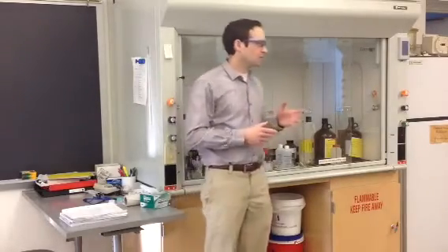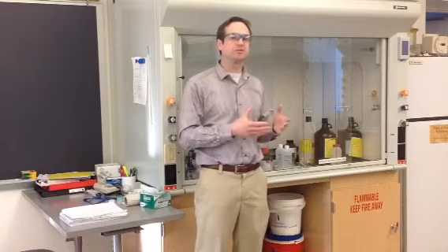So there's 3 things that you're going to have to add into your reaction mixture. You're going to have to add your alcohol, your carboxylic acid, as well as a mineral acid to help catalyze the reaction and push it to go forward. Now we're also going to be using an excess of one of these reagents. We said that we're going to need to push the reaction using equilibrium, so we can swamp it with starting material, and that will drive the reaction to product. We could also have taken away water. We're not going to be doing that today.